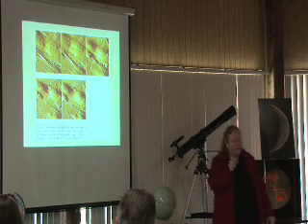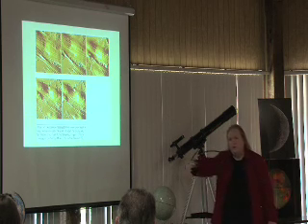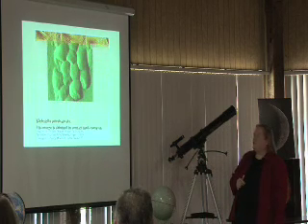Remember, optical microscope things have to be transparent. AFM, you're just imaging, you're using your probe. You're scanning your probe over the surface and it tells you what the shape of that object is.